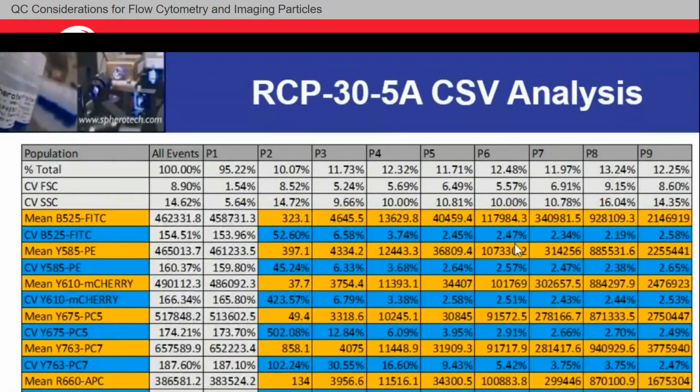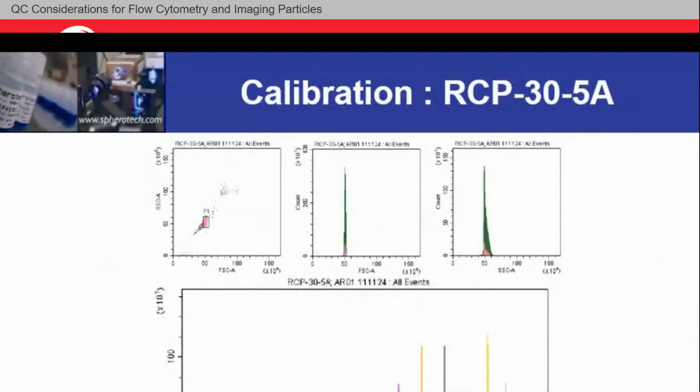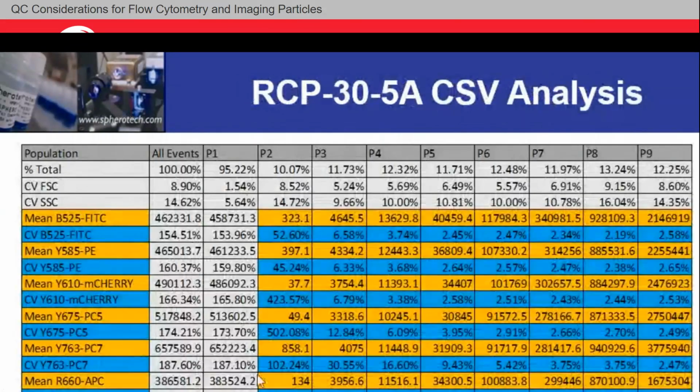50%, 6, 3, 2, 2, 2, 2, 2, right? These usually are dropping. Very high, much, much lower, sometimes highest. But there's always a reduction in that CV as the intensity increases. We can see that visually. This CV is much broader than these higher CVs, right? So as we increase in intensity, we're usually decreasing in CV.